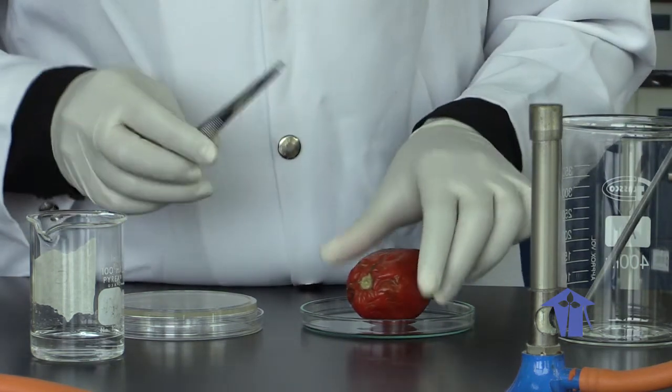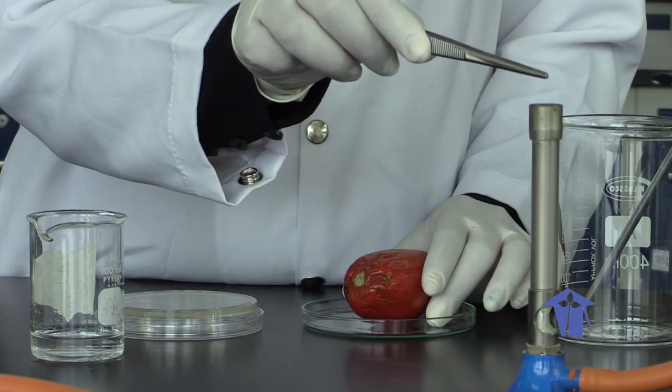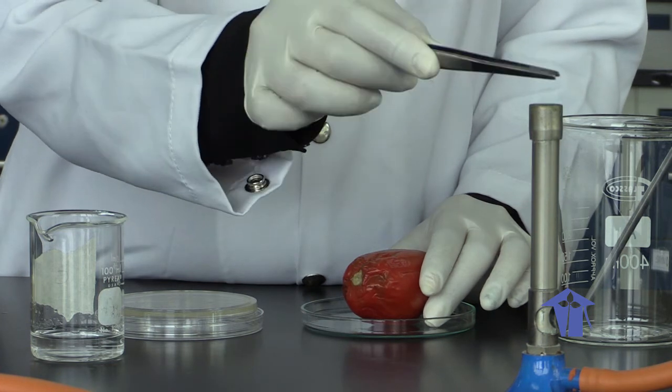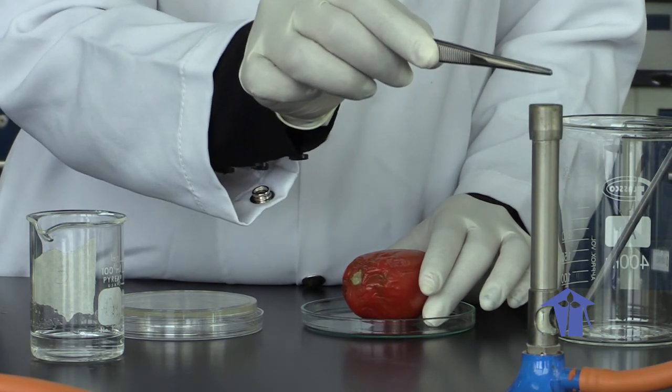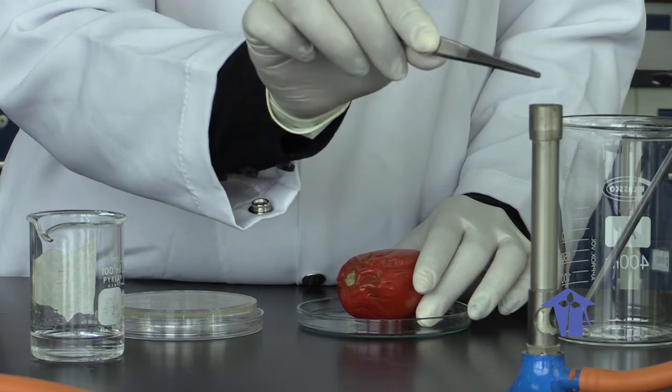So the first thing we need to do is pierce the skin of the tomato to ensure that we're getting a proper sample of diseased tissue. So we're flaming our forceps. Make sure we practice all aseptic technique in this lab to prevent contamination of our sample.